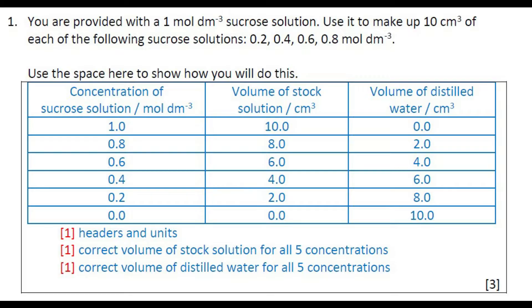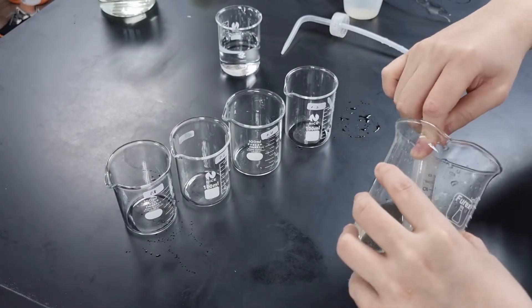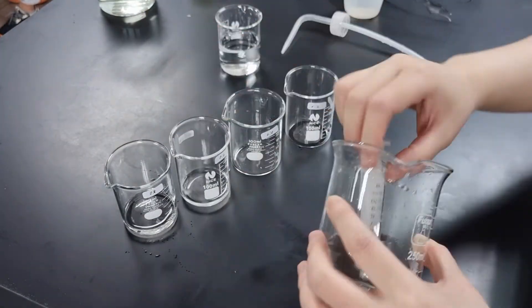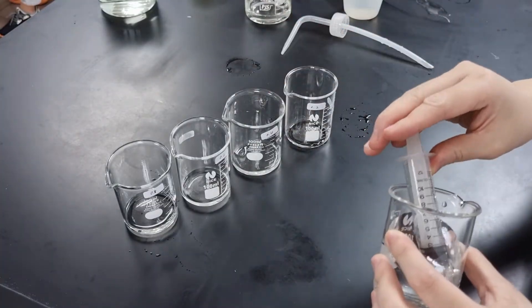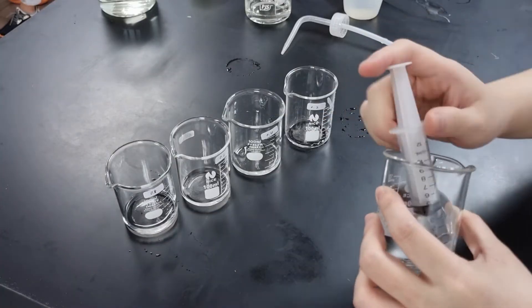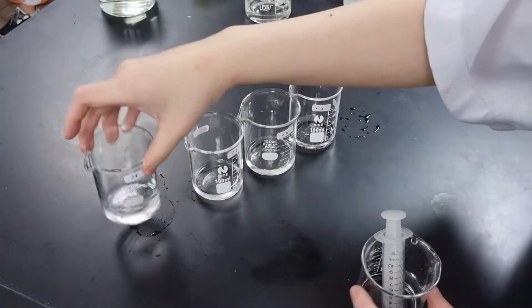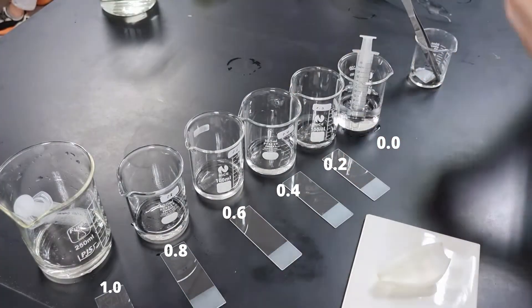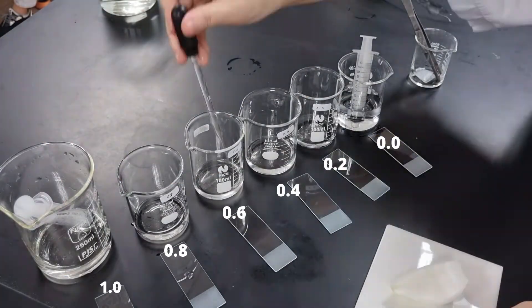There should be six concentrations in total, and this is me doing them in real life. I use the stock solution in this beaker and put different volumes into all the different labeled beakers: 8 cm³, 6 cm³, 4 cm³, 2 cm³, and then add water to fill each up to 10 cm³. I'm using a syringe to measure here, as the markings on the beakers are usually not accurate. So six concentrations, including 1 and 0, which is just distilled water.